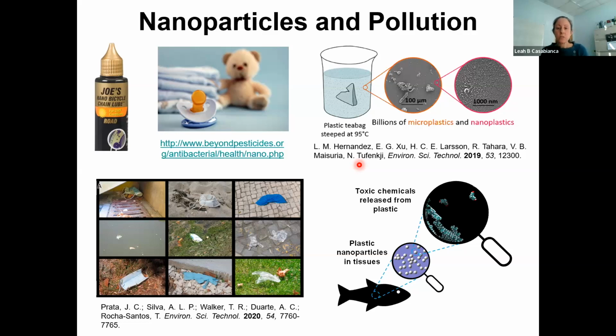So it's important to have techniques whereby we can understand not only which small molecules bind to different nanoparticle surfaces, but also the mechanism for binding, so that we can potentially design plastic that is not going to expose different reactive surfaces as it breaks down, or even inform regulatory policy. If there's a particular molecule found in polluted water that tends to absorb to nanoscale plastic, maybe we want to screen for this in the fish that's intended for human consumption.